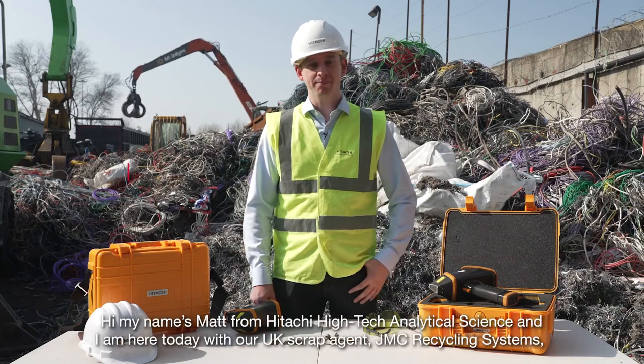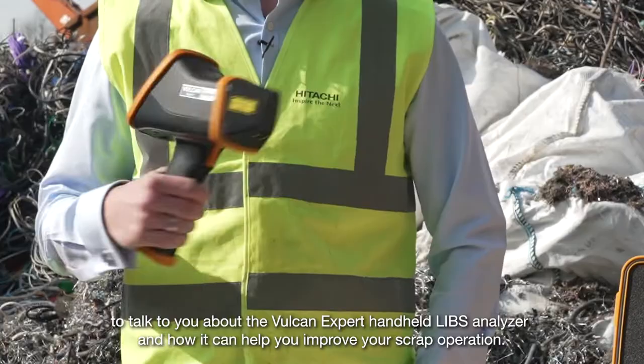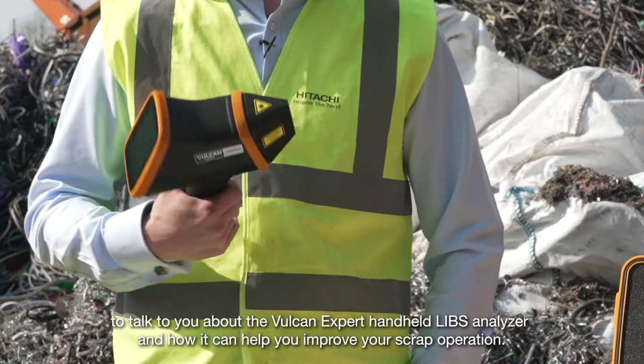Hi, my name's Matt from Hitachi High Tech Analytical Science and I'm here today with our UK scrap agent JMC Recycling Systems to talk to you about the Vulcan Expert Handheld LIBS Analyzer and how it can help you improve your scrap operation.